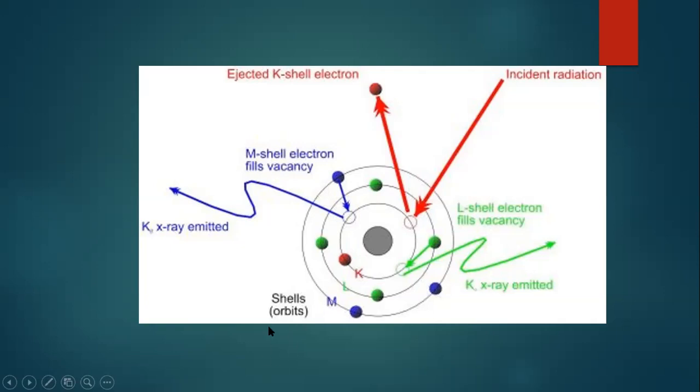As a result, this displacement will occur because of the difference in energy. So we will have a difference in energy between the primary X-ray, which has been emitted from the analyzer, and the binding energy that holds the electrons in their proper orbits here.